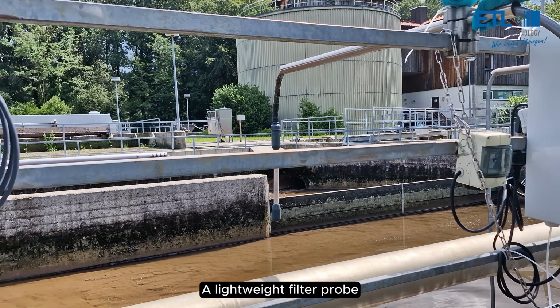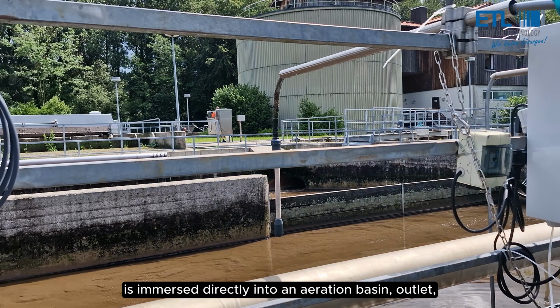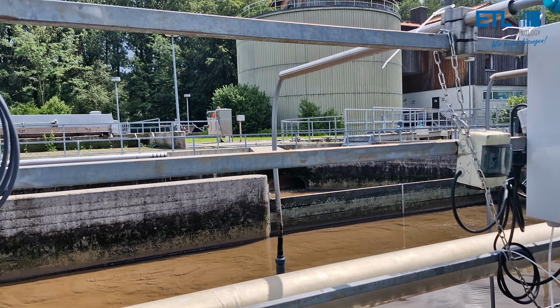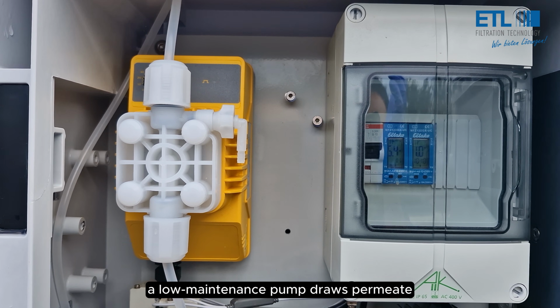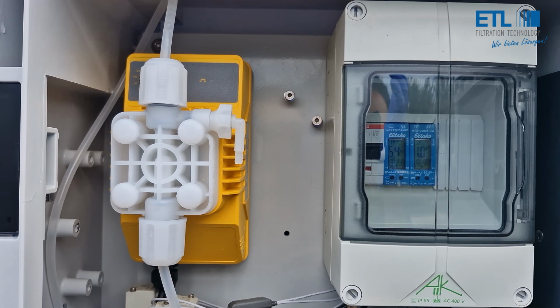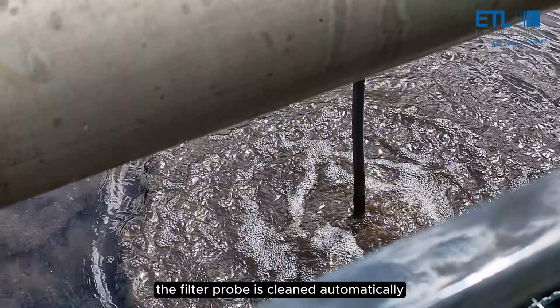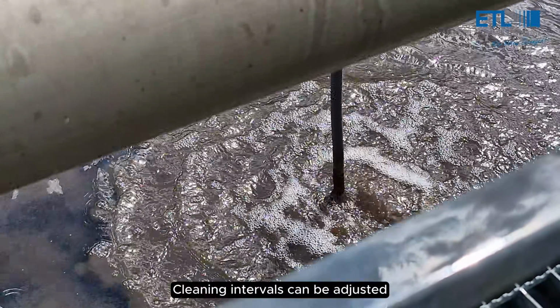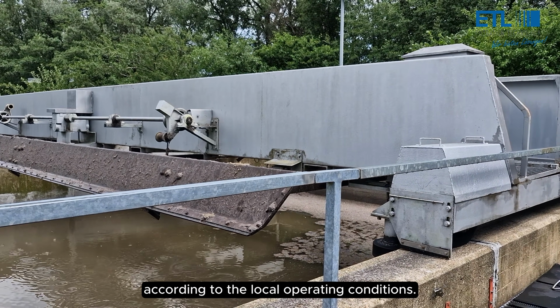A lightweight filter probe is immersed directly into an aeration basin, outlet, tank, or channel. Inside the CTS-P panel, a low-maintenance pump draws permeate through the filter membrane. To maintain filtration performance, the filter probe is cleaned automatically using compressed air. Cleaning intervals can be adjusted according to the local operating conditions.